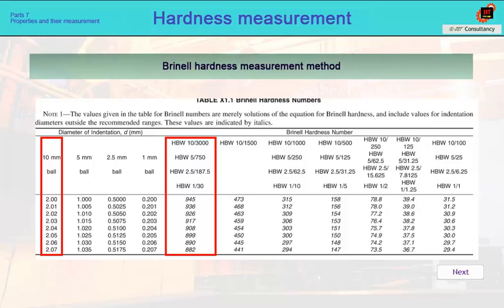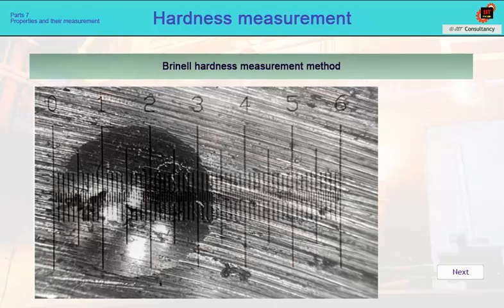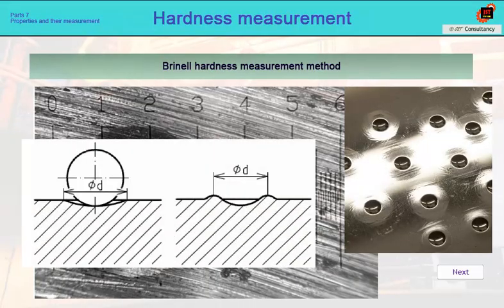However, we do not always have an image of the indentation in such a way that we can simply read it. In the case of a hardened material, we run into the problem of the material bulging around the indentation. This can be clearly seen in this picture. Reading the diameter is then difficult, and if we are to do it correctly, it requires at least good lighting.